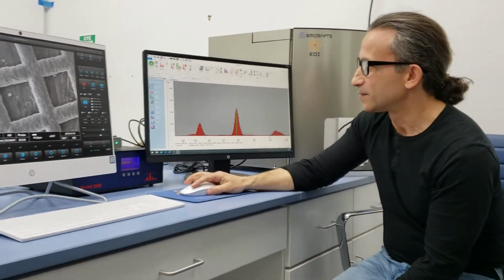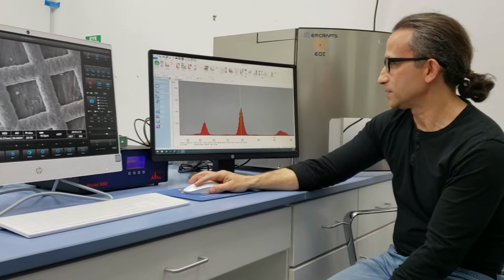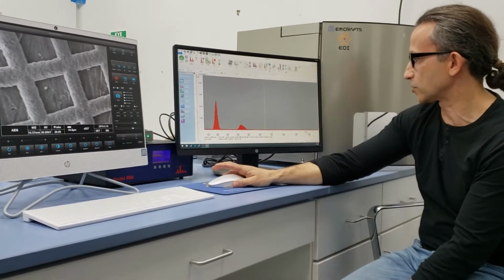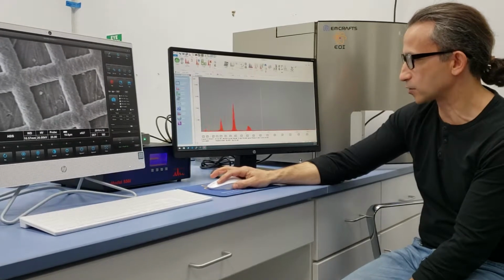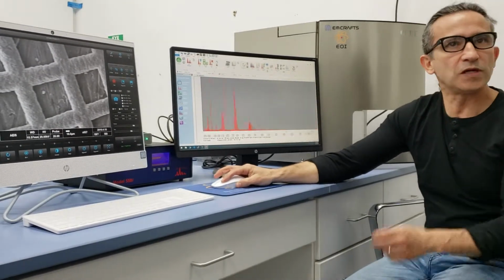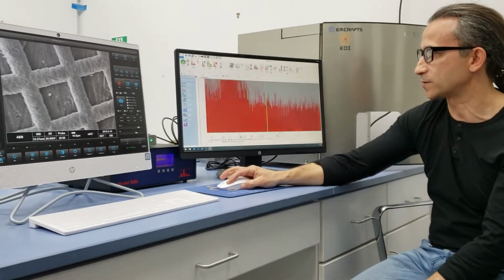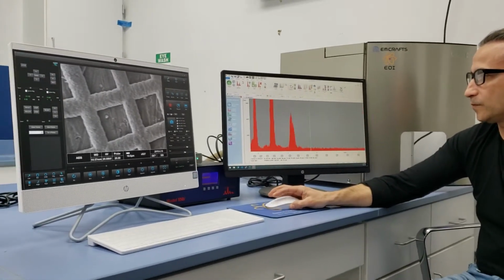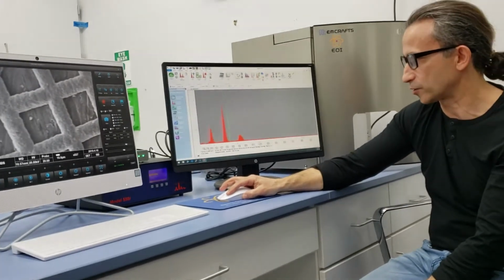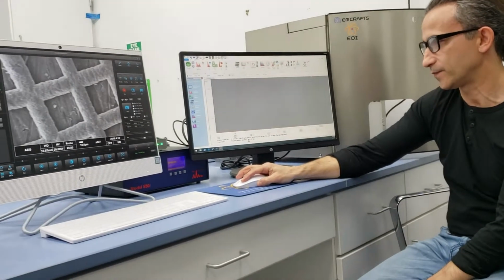Okay, so we acquired the Spectra, and all I went over right now is just using the cursor. Left click the mouse, puts a cursor. Left click, hold, drag to the right, drag to the left, drag up, drag down. You manipulate the Spectra using your mouse. Or you could do it the old way. Grab a slider and start sliding the window, right?